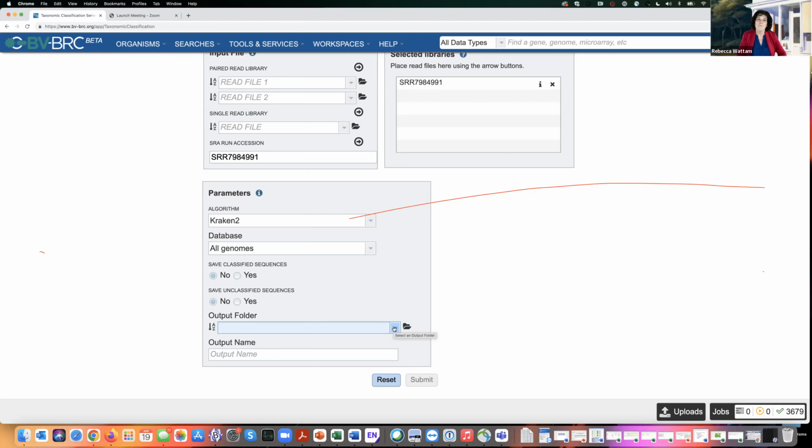But I would say if you do have that, if you can work through command line, because in the resource you can find out about the command line tutorial and do things command line. If you're not good with that, just contact us through the help button, and until we get this service enabled, we can help you with that.